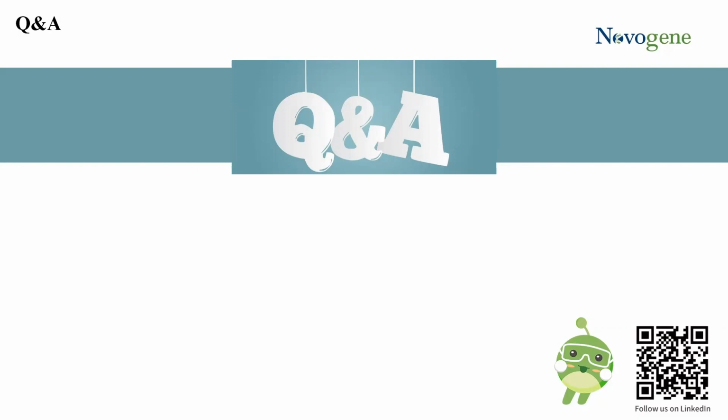Abhi, there is this question from Marina where she's asking what are some of the sample requirements and recommended extraction procedures for circular and long non-coding RNA. Could you speak to that?